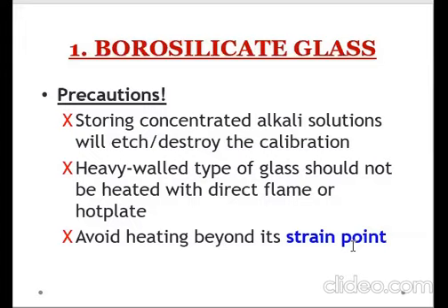Okay? So, we need to consider the strain point of the borosilicate glass that we are using. Okay? So, also another reason why we need to consider the strain point, again, because if you exceed that one, and then later on, papalamigin mo yung glass, pag papainitin mo yan ulit, no? For sure, again, magka-crack yan siya. Okay?